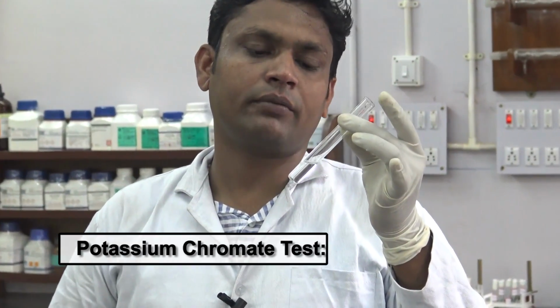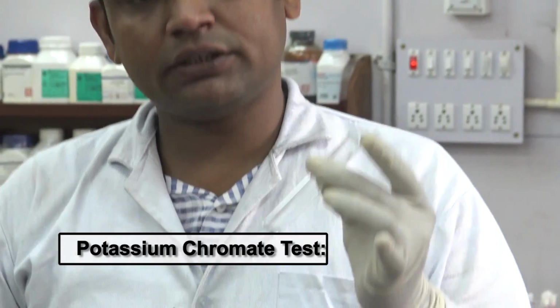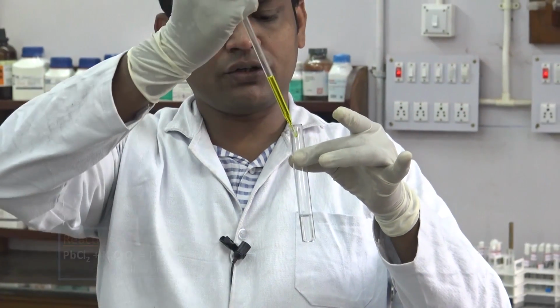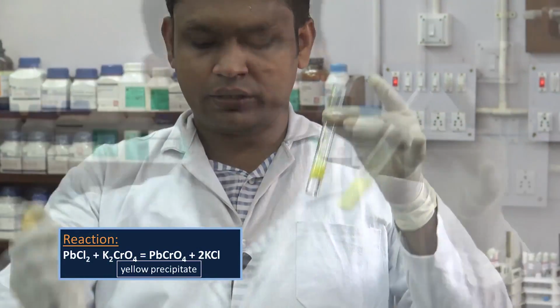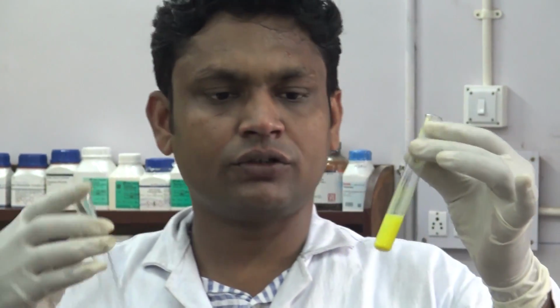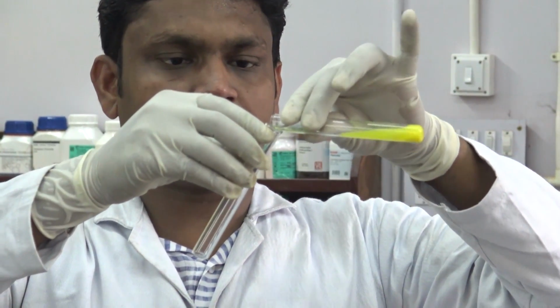For another confirmatory test of lead, we will perform the potassium chromate test. For this, to the other part of the test solution, we add a few drops of potassium chromate solution. Here also we can see a yellow precipitate forms, which we divide into two parts for the solubility check.